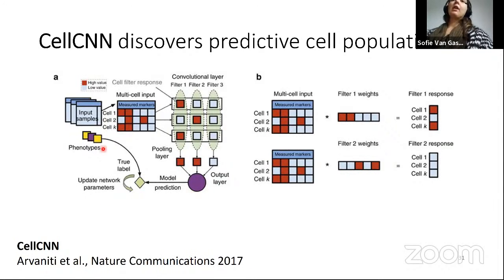And then all of this is optimized together during the learning phase, so that it is really trying to find exactly those populations which are informative for your final label of the samples. And by not having this in two separate steps, but all of this in one model, this could also give some advantages, of course.